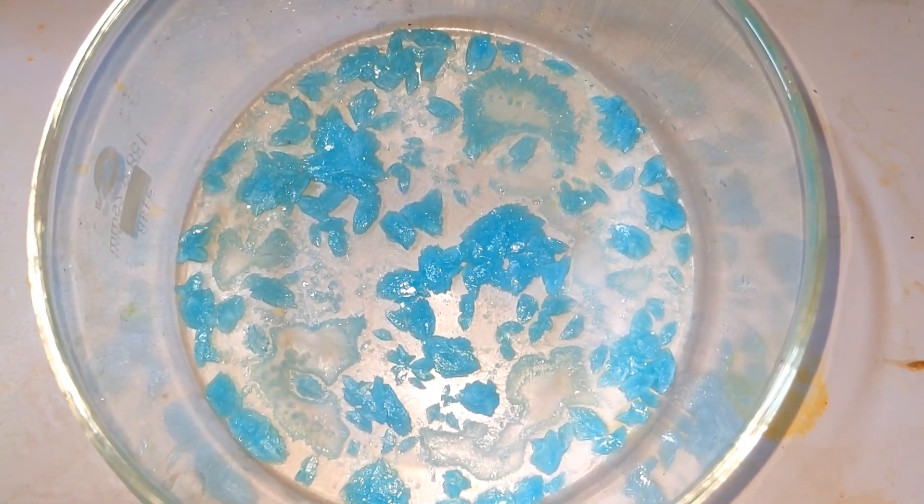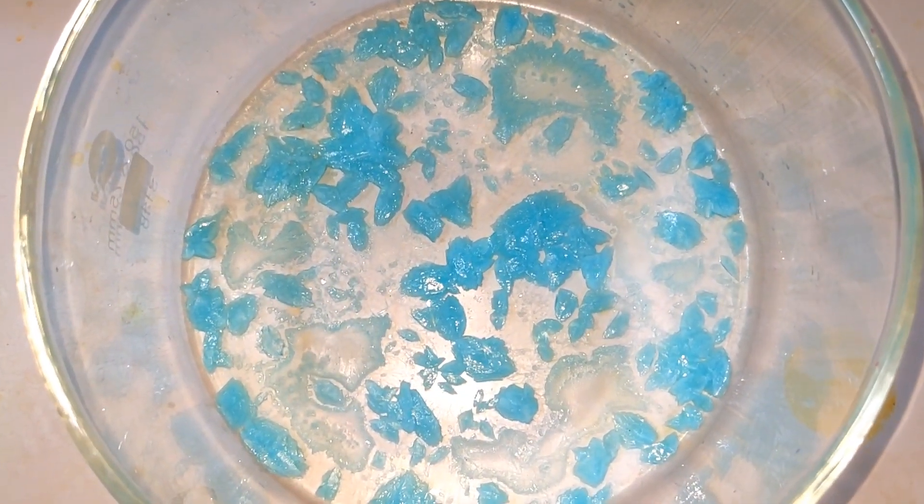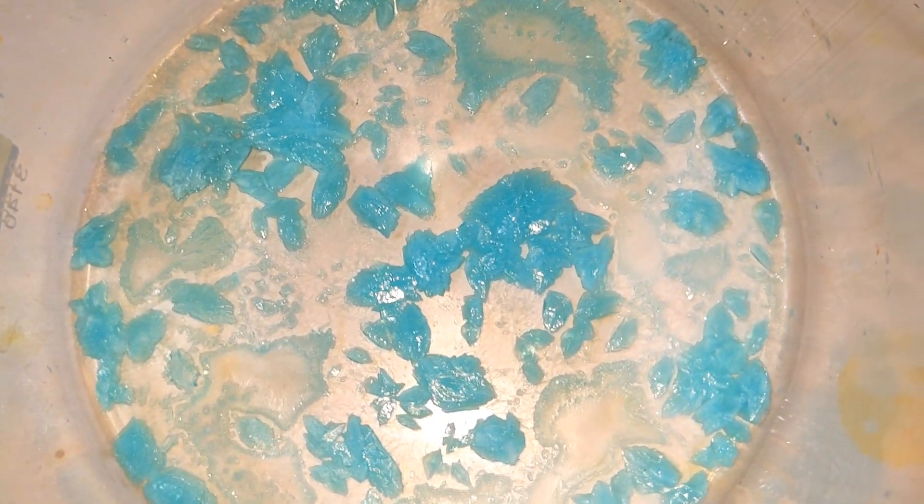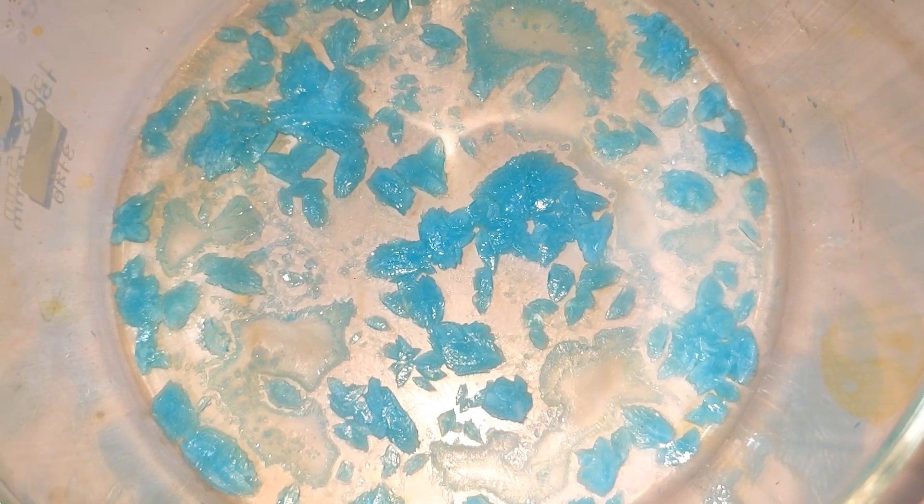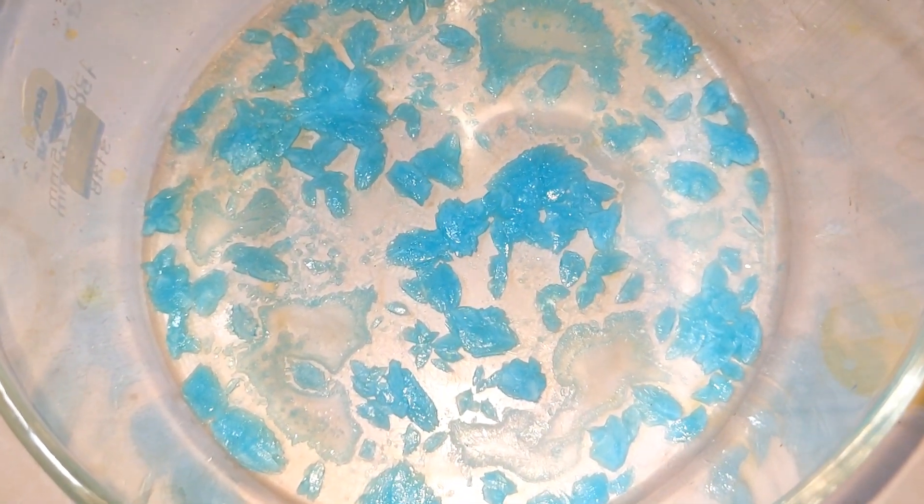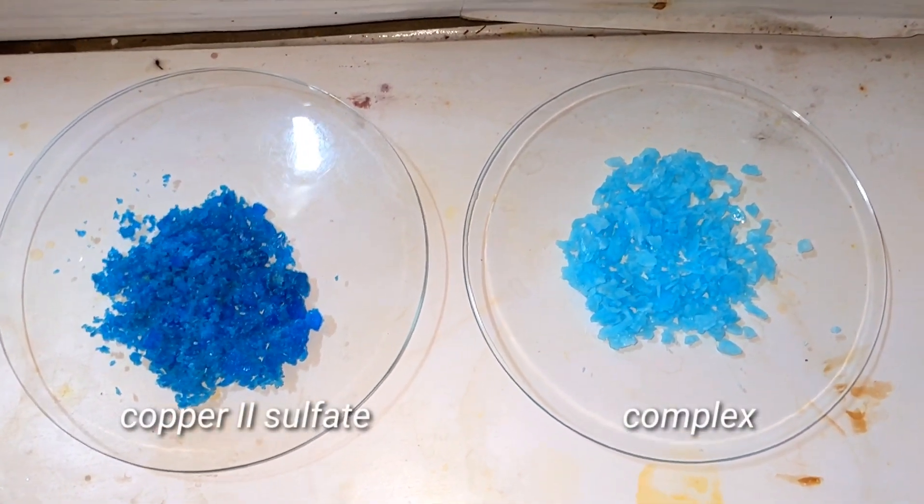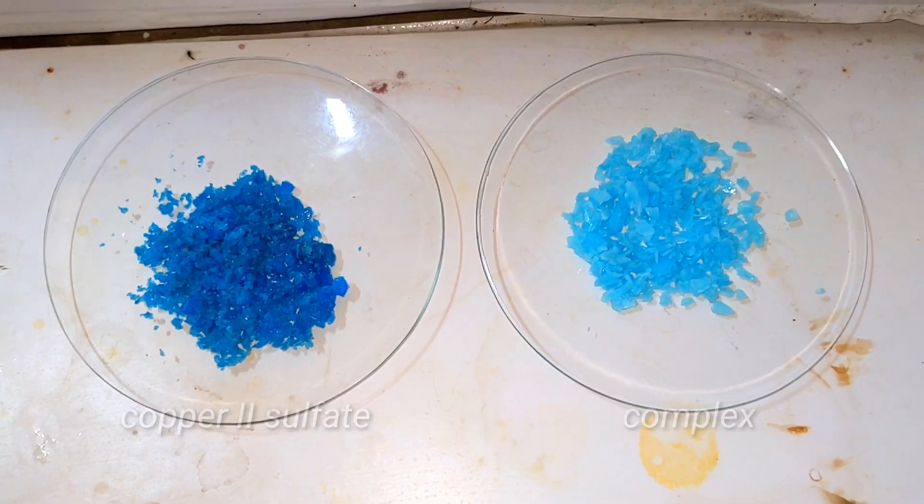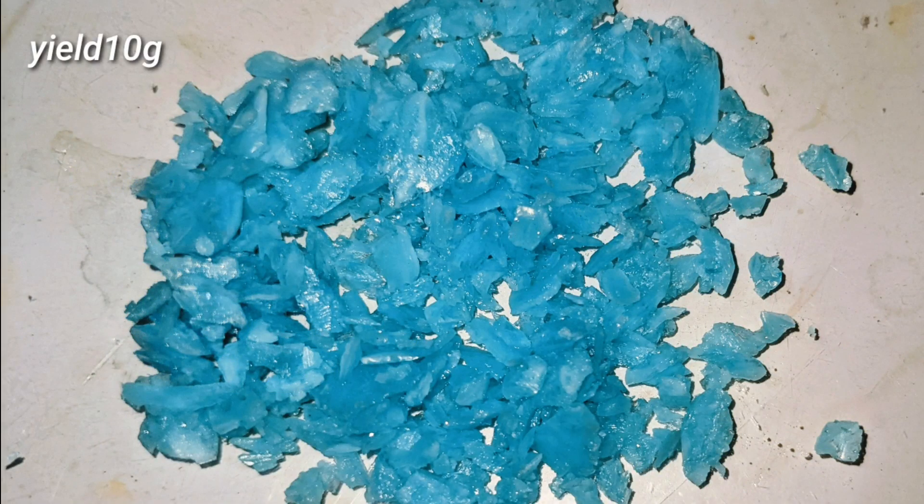When the water evaporated, beautiful cyan colored crystals of double salt ammonium copper 2 sulfate hexahydrate separate out. The crystals were scraped out of the crystallizing dish and were dried. This shows how the color of the double salt is pretty much different from the copper 2 sulfate. The final yield I obtained was 10 grams.